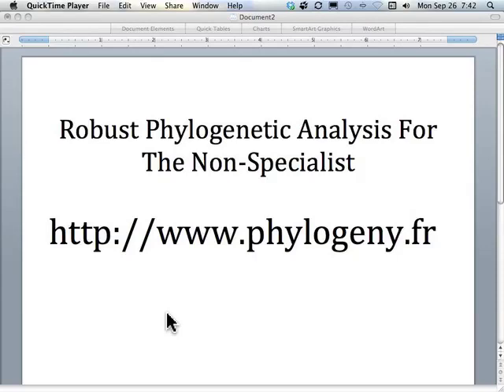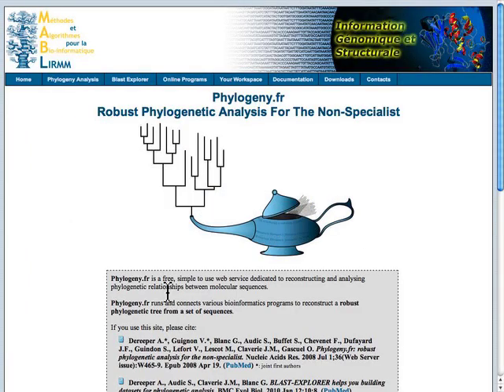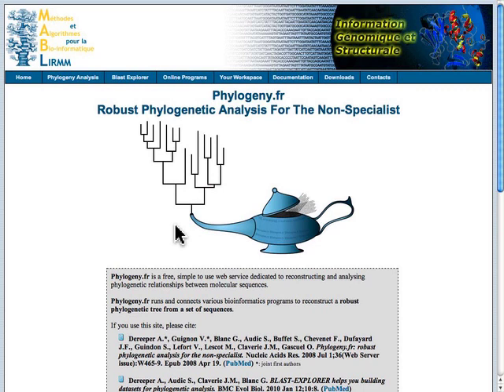Hi, this is a brief introduction to how to use the robust phylogenetic analysis for the non-specialist tools. They're available at the web address shown here. I'm going to jump over to that website. When you load it up, you'll see this page.